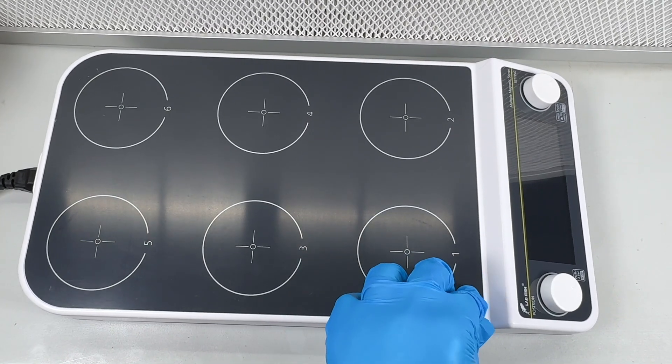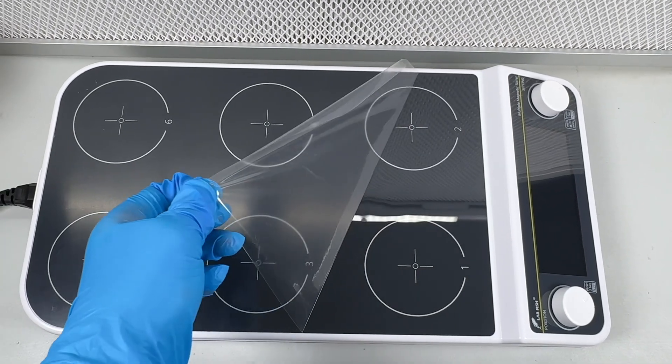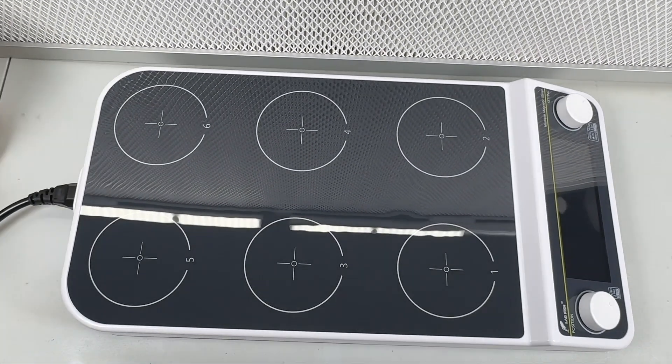Welcome back to Sporn Sprout. In this video, I just wanted to show you this awesome six-position magnetic stir plate that I use to stir my mushroom liquid culture jars.